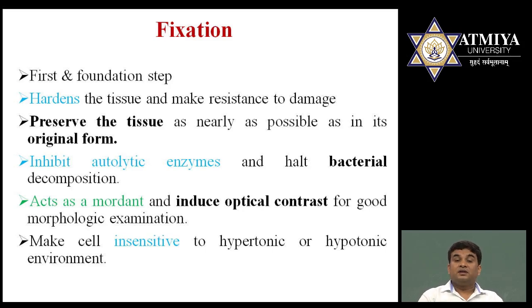Moreover, it will also stop the bacterial activity and inhibit the autolytic activity. This is the most common main application of the fixation step. It also acts as a mordant, so it will induce optical contrast and good pictures will come while using the microscope. And the last application of fixation is that it makes the cell insensitive to hypotonic and hypertonic solutions.